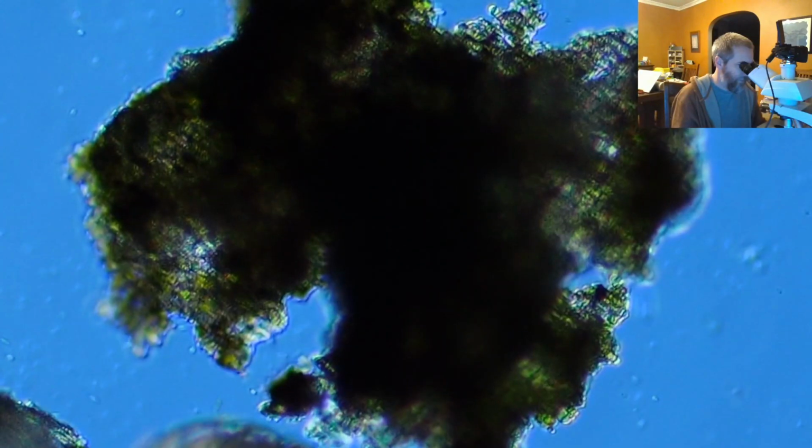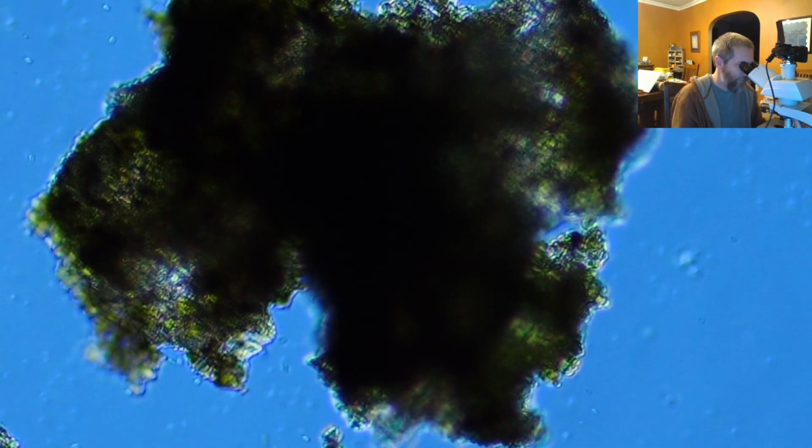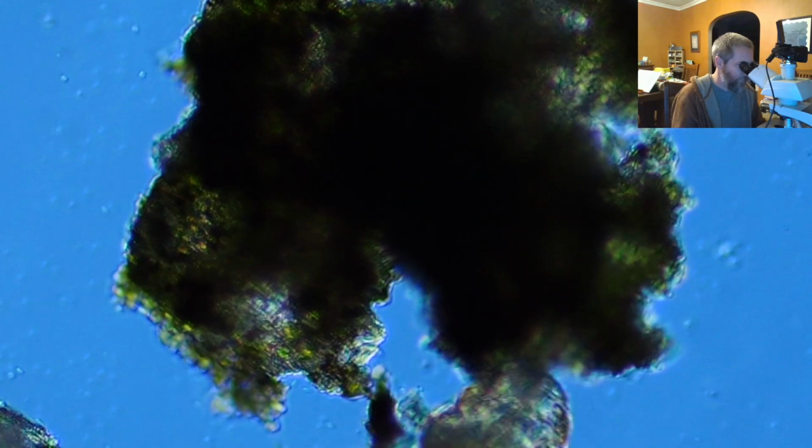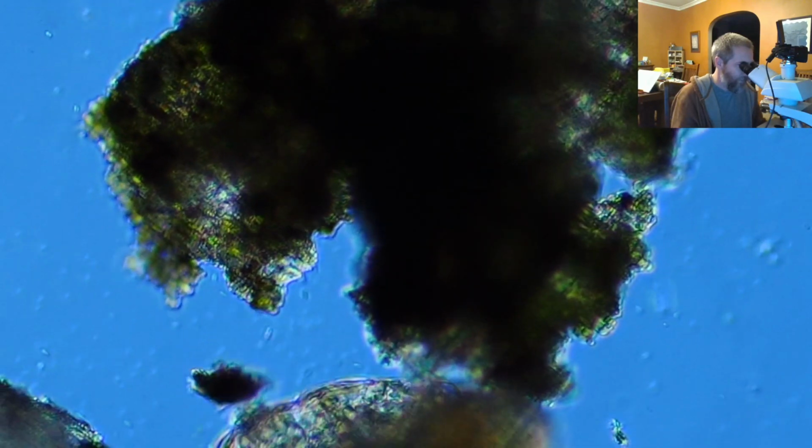Ooh, what's going on here? There's that water bear, and maybe another one behind it. But after... It was just a really big one.